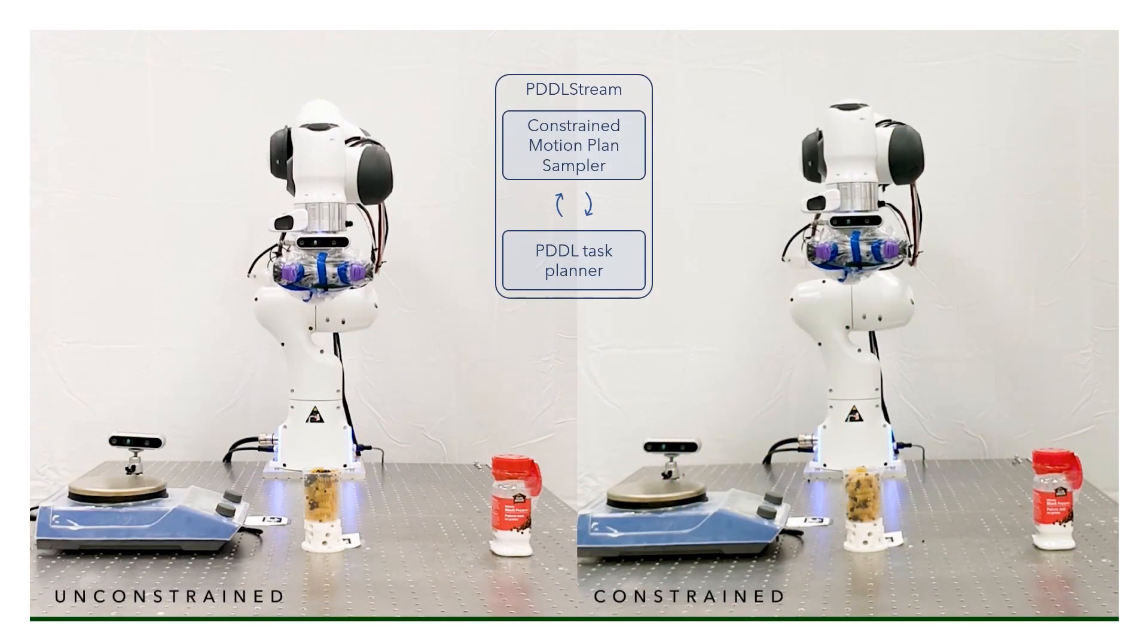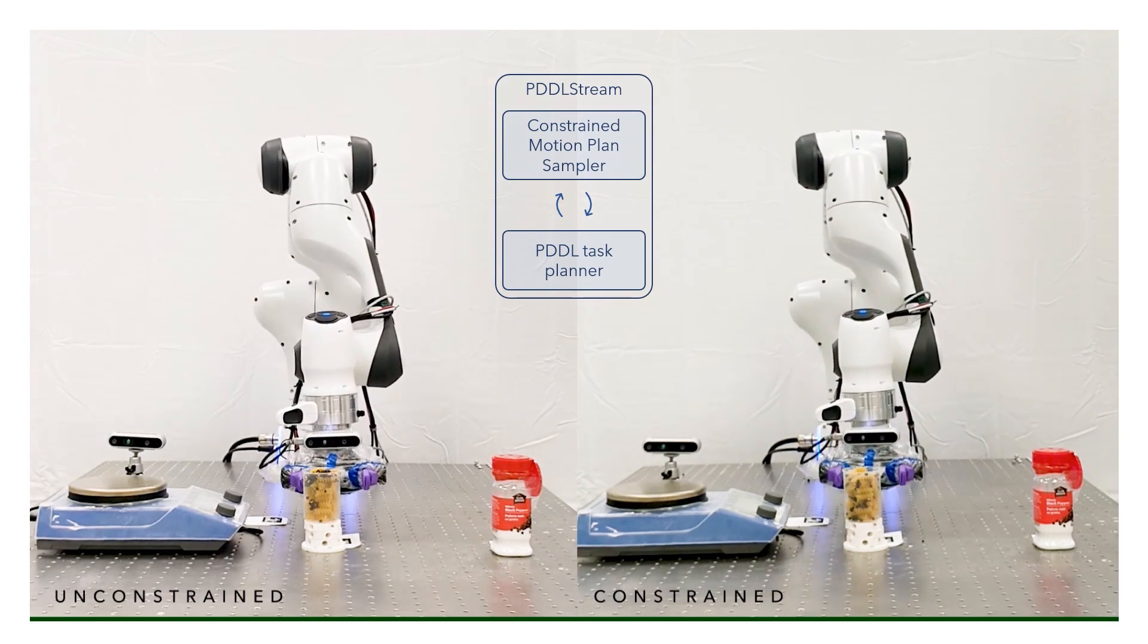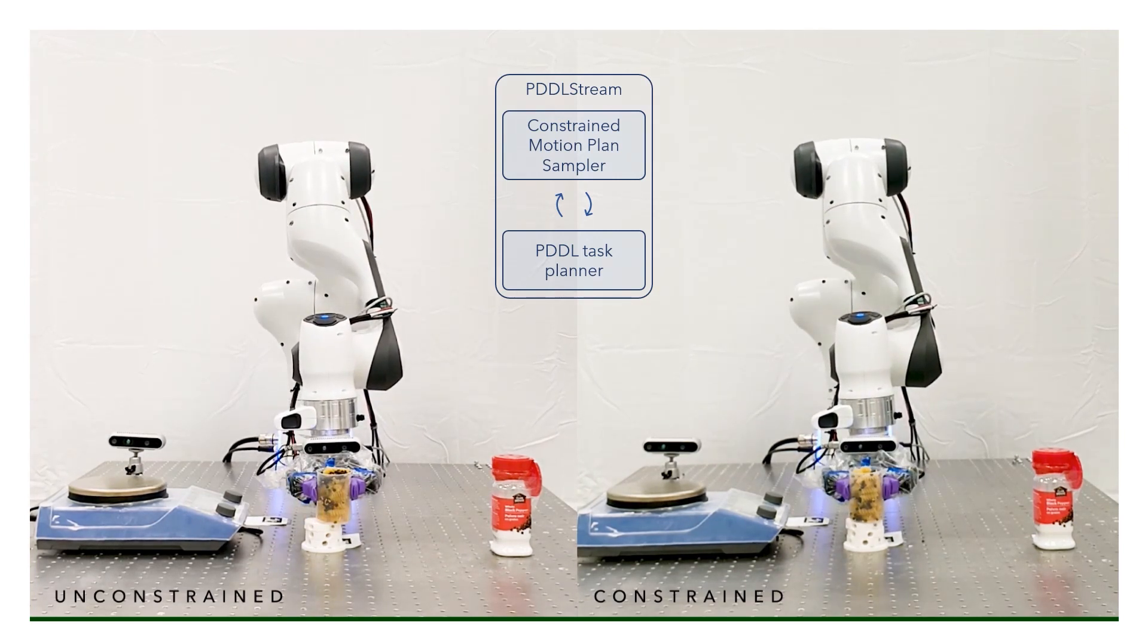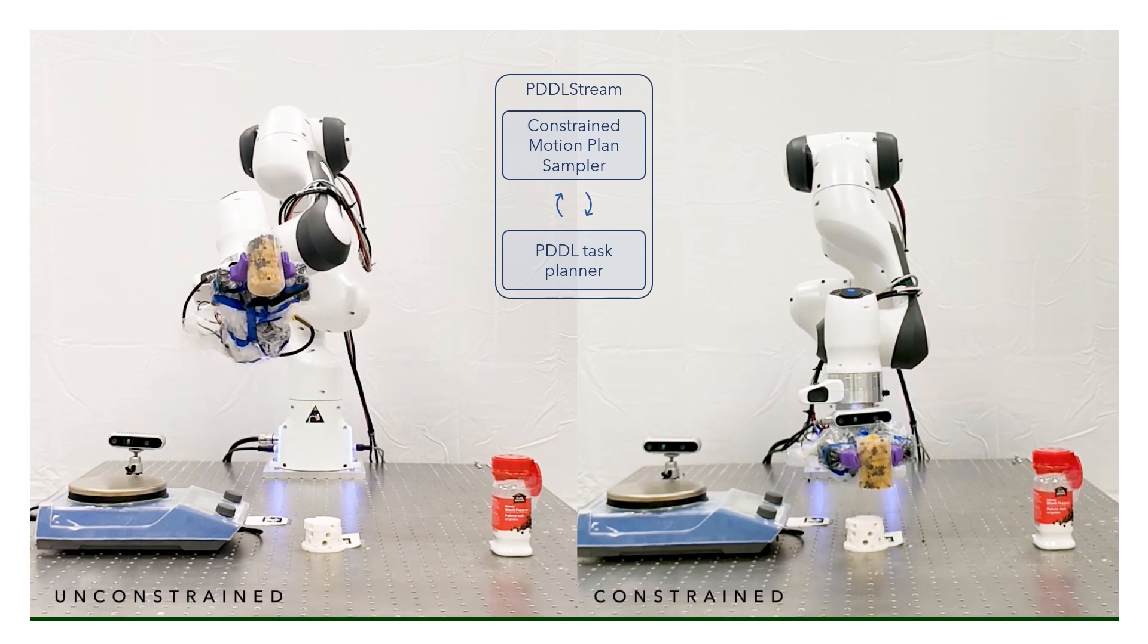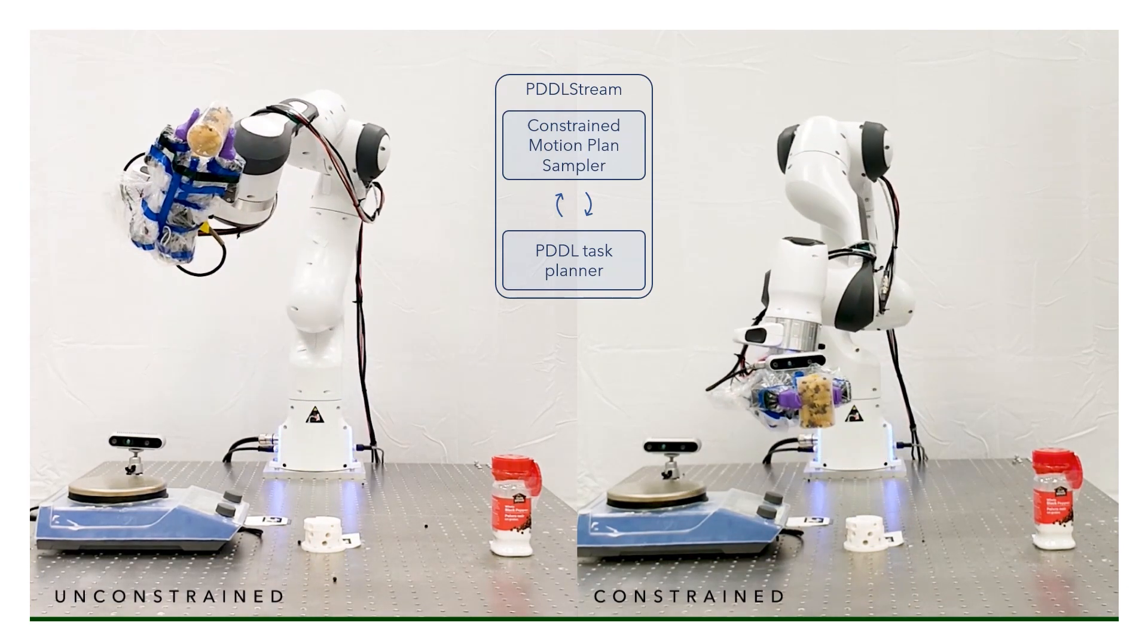We use PDDL-Stream to do integrated task and motion planning. PDDL-Stream is extended with a custom-constrained motion planner to ensure that chemical reagents are not spilled during manipulation, the importance of which is shown in this video.